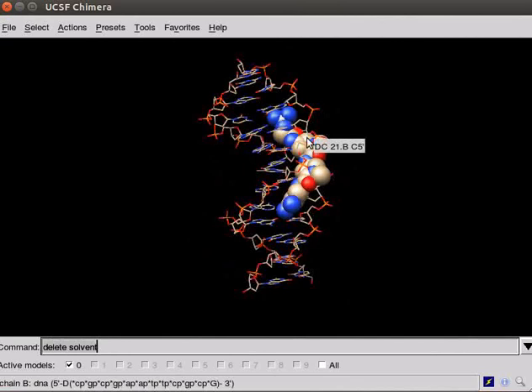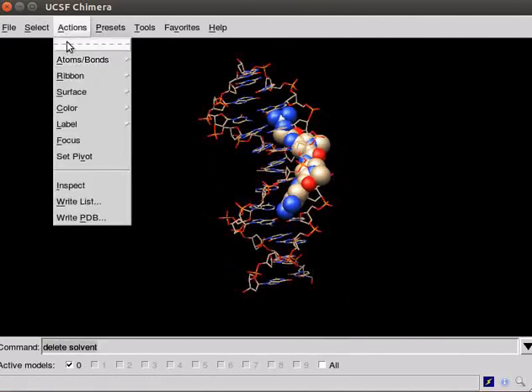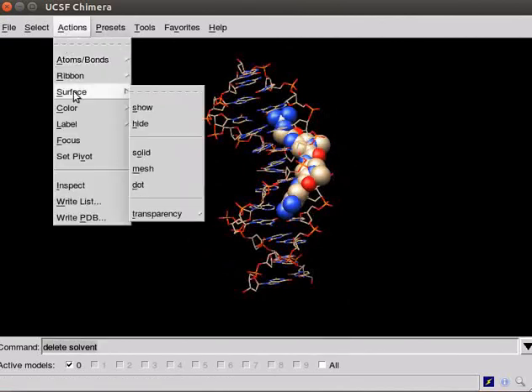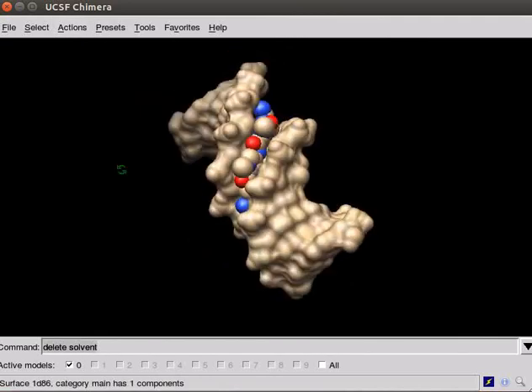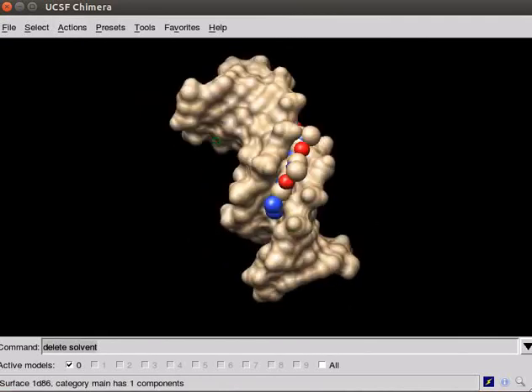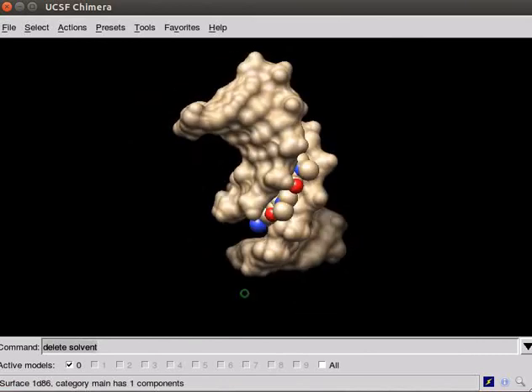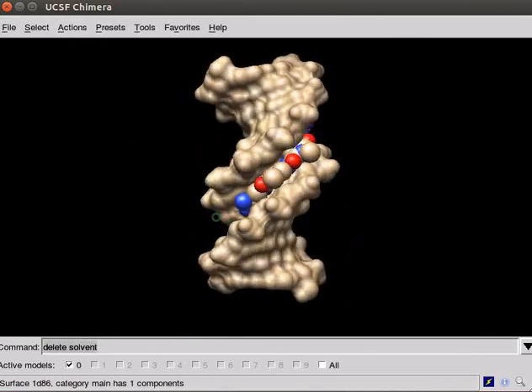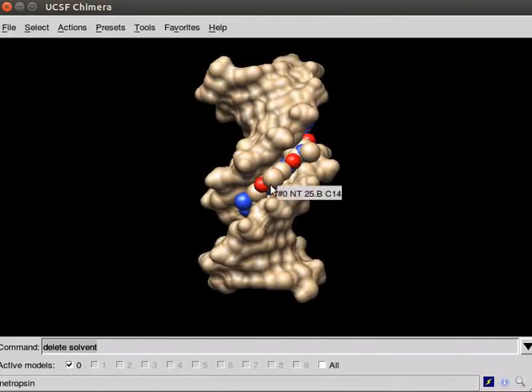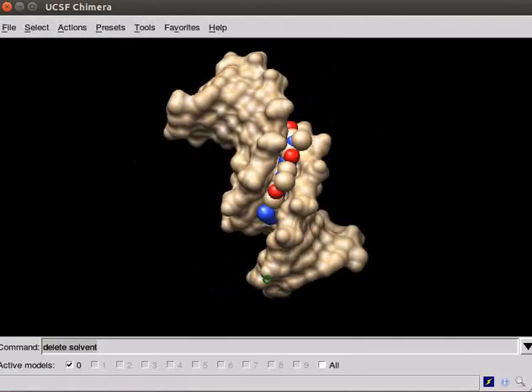To show the surface for this structure, scroll down the Actions menu. Select Surface. From the submenu, select Show. Observe the panel. The DNA structure is now displayed with the surface. Major groove and minor groove are clearly seen in this picture. The ligand Netropsin is seen bound in the minor groove.